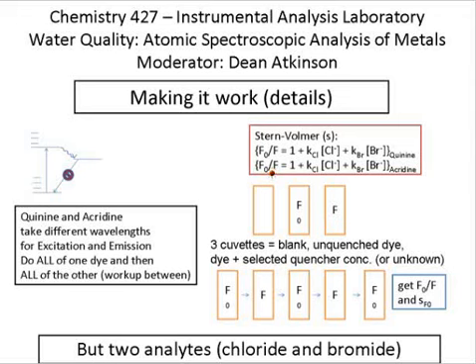There are also uncertainties associated with all 4 of these slopes. So these are all slopes. You remember that we can use the calculations within the data analysis tool pack of Excel to calculate the uncertainty associated with these slopes.